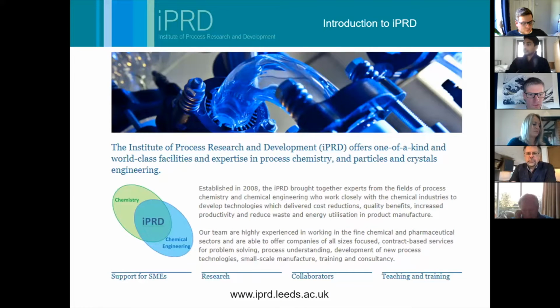So John mentioned IPRD. IPRD is our Institute of Process Research and Development, and it's within IPRD that we've done many of the developments of the fReactor. This was never a big funded project externally. It was something that we started. And the students within IPRD, a mixture of engineers, chemists and biology students, and the academics have all got involved in this project.